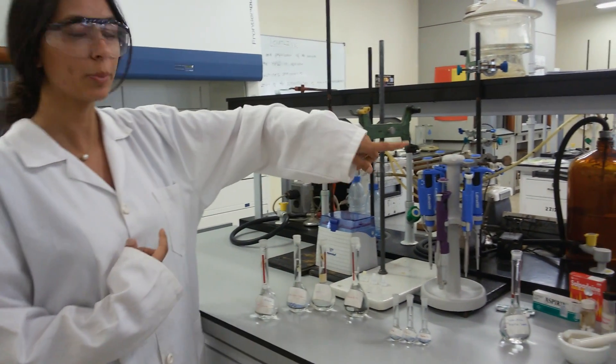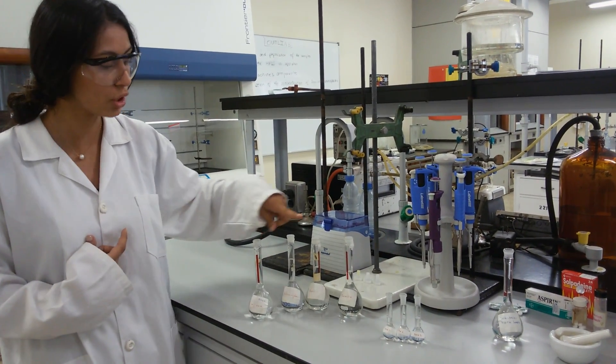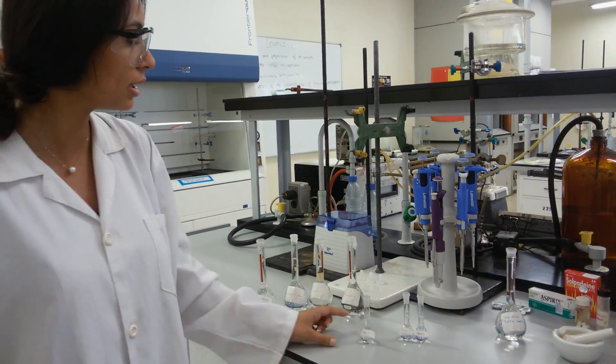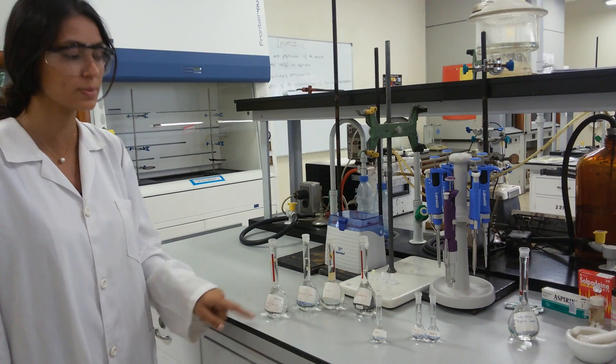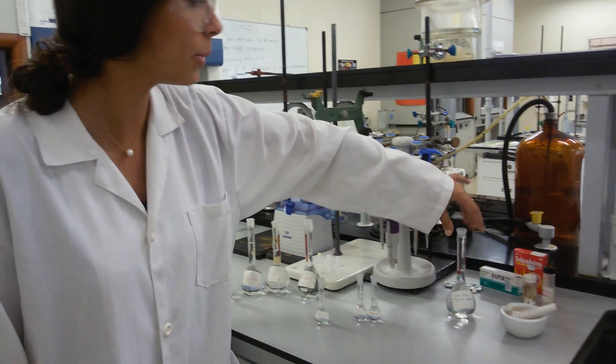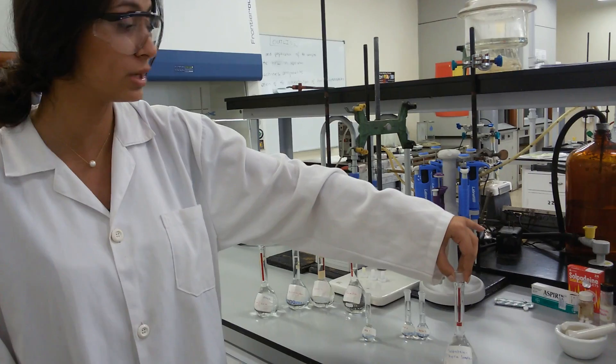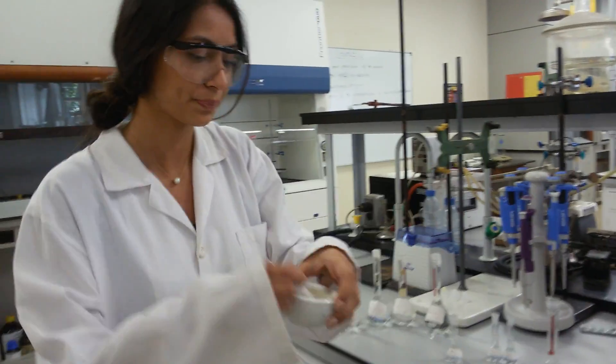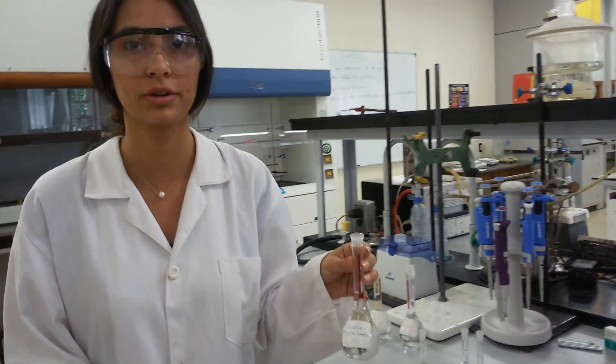Then, using micropipet, we will pipet from each of the stock solutions to prepare three standard solutions containing all of the four active ingredients but at different concentrations. Finally, we will prepare the sulfadain and aspirin solution by grinding the tablets and mixing them with ethanol and water to the line mark.